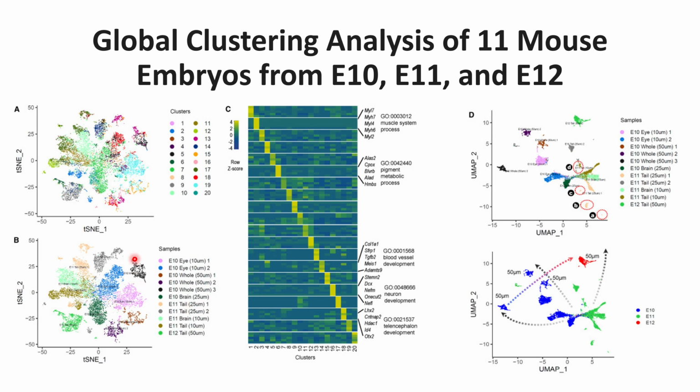One thing that they can see in this UMAP is that although different samples cluster themselves into the same group, for this E11 channel they can see that it is not grouped together into a single cluster. However, it is grouped into 4 different clusters that can be seen here. So they decided to check why this is split into different clusters. It might be because the tissues or samples are different.